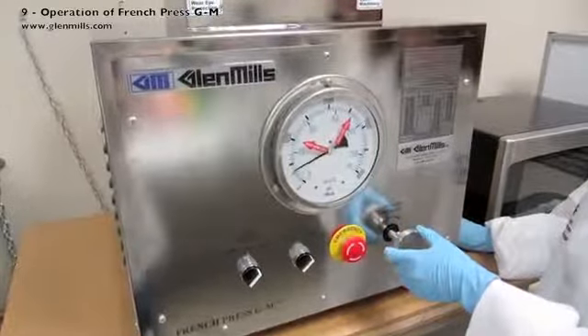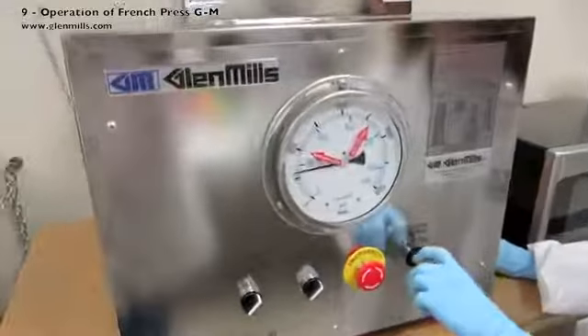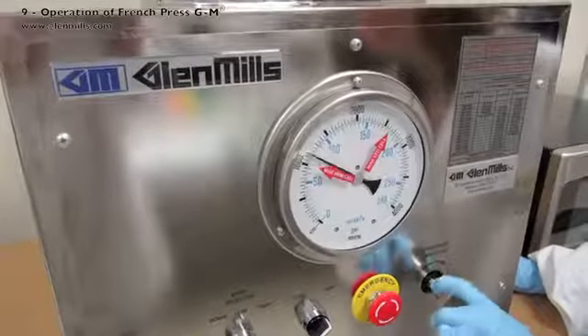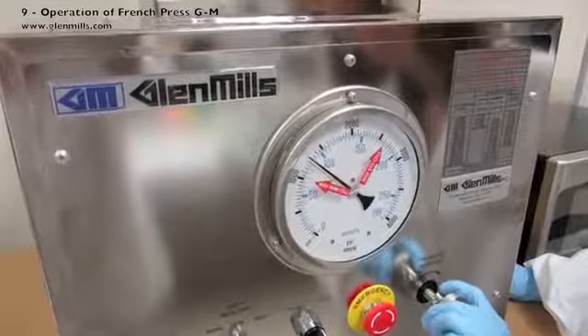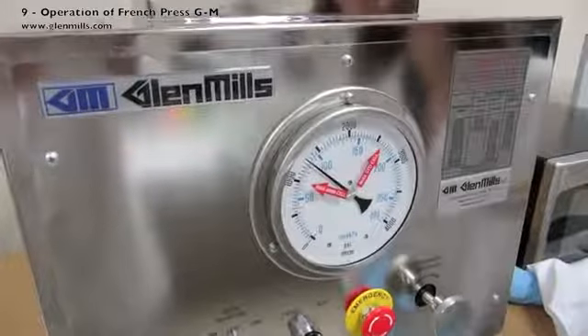Adjust the pressure increase knob clockwise until the pressure gauge reaches the desired value. For this example run, the target is 1280 PSIG. Once the target pressure is reached, or held at a pressure for a few seconds or minutes depending on the protocol, the samples can be released from the standard pressure cell.